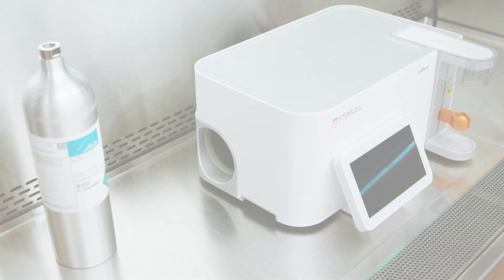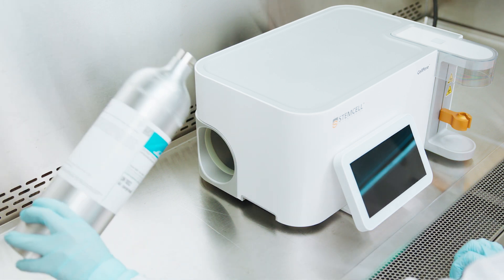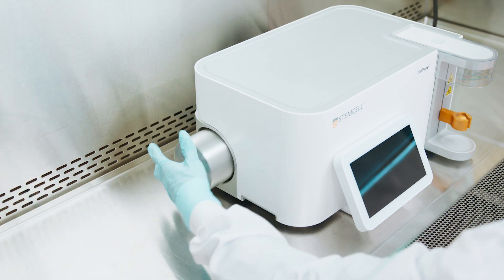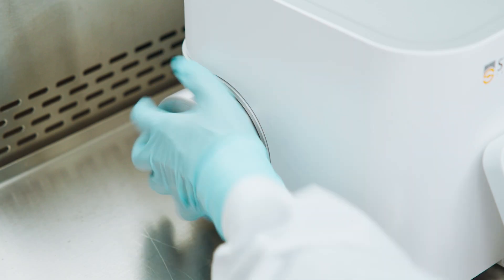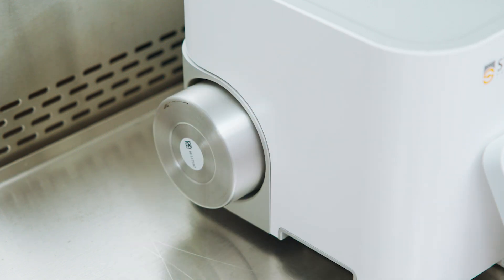Part 1: On the day of transfection. The CellPore Transfection System requires an adequate supply of compressed air in order to operate. Before proceeding, ensure the threads of the cylinder are clean and free from any debris or visible damage. Insert a new cylinder via the gas access port located on the left side of the instrument — a bit of wiggle can help fully insert the cylinder. Once fully inserted, turn the cylinder clockwise to fully engage the valve. Continue turning until the cylinder is unable to rotate any further.